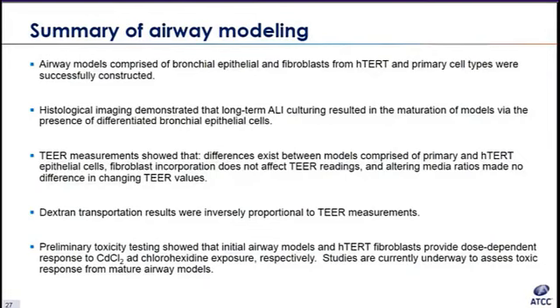And finally, preliminary toxicology testing showed that the initial airway models with the hTERT fibroblasts provide a dose-dependent response to cadmium chloride and chlorhexidine exposure, respectively. Studies are currently underway to assess toxic response for mature airway models.